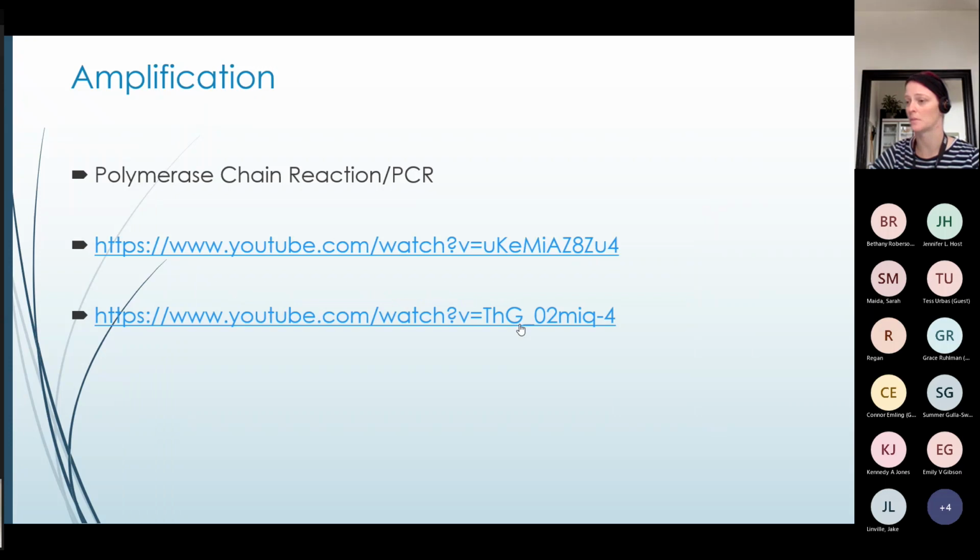So step 2 is amplification. There's some YouTube videos here that show PCR. I'm not going to show these. We can maybe come back if we have extra time, but yesterday I went really over, so I don't want to do that tonight. So we'll come back if we have time. You can watch them on your own as well.